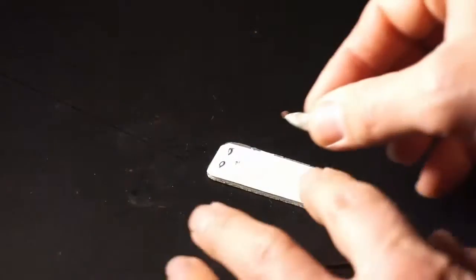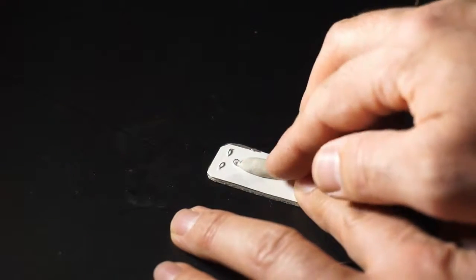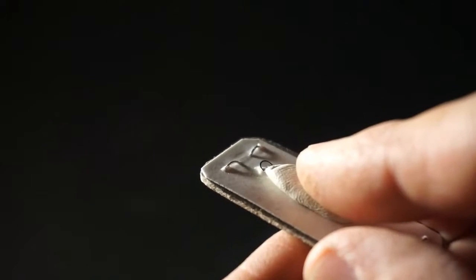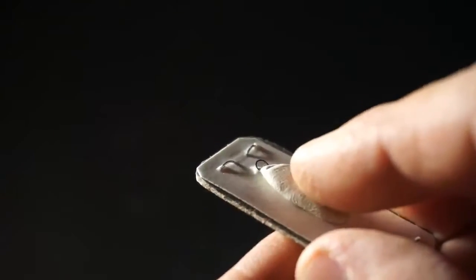The sample is mounted using sticky tack, so stick your sample to the sticky tack and then stick the sticky tack on the thin paper side. You focus it by pivoting, so you push your finger down and the sticky tack pulls the sample away from the lens. You push it up, it pushes the sample closer to the lens.